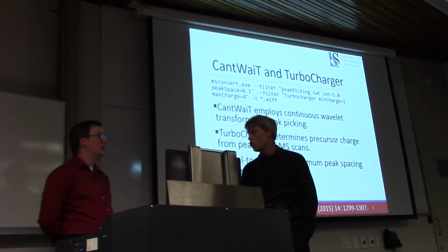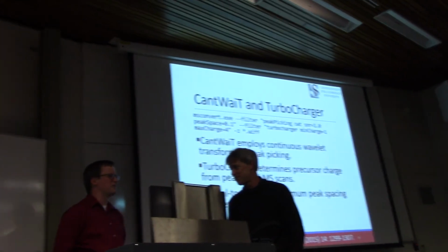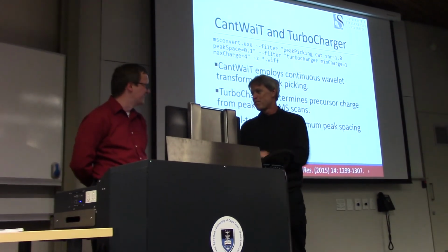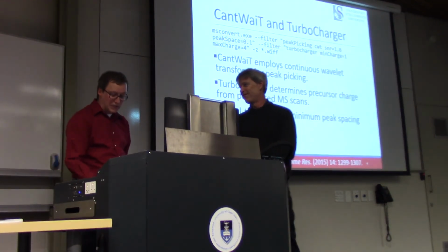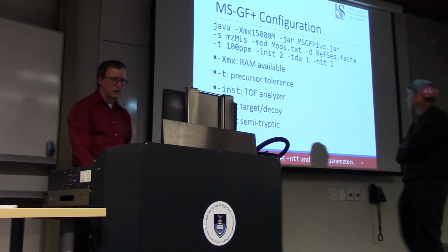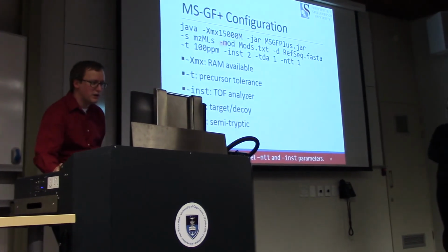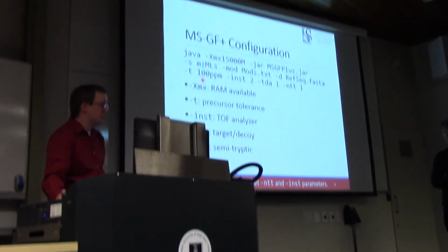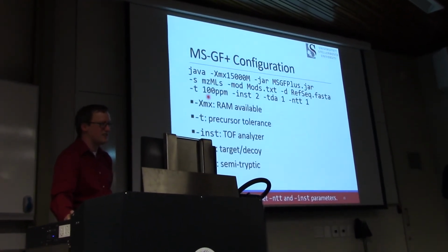Well, first off, your estimation of 100 ppm is not low resolution. That's still pretty good. I mean, that's like within 0.1 m/z. But yes, certainly the search could be different. So if I were to change these settings right here to 50 ppm, which conveniently I have done, the numbers of identifications are slightly lower.